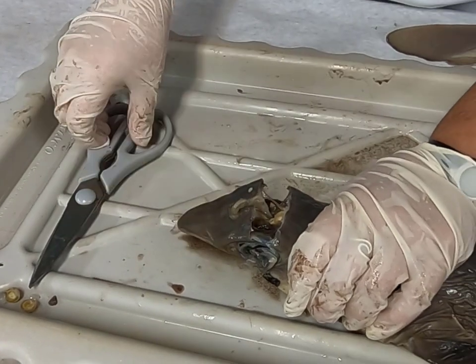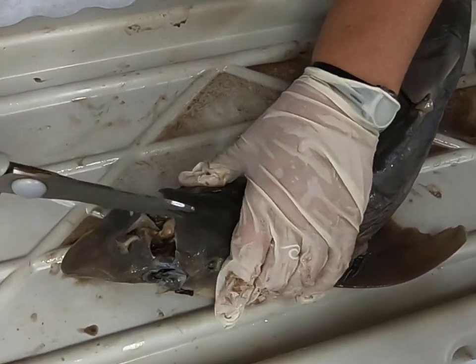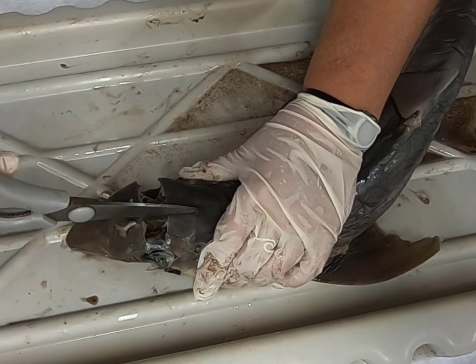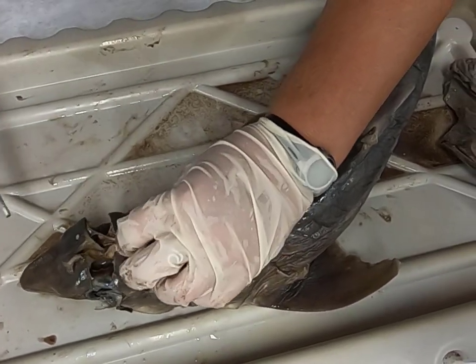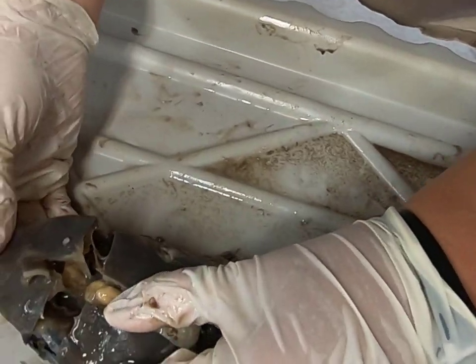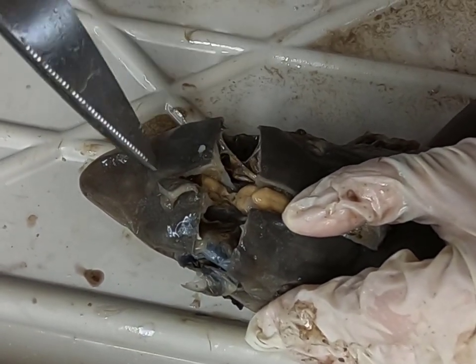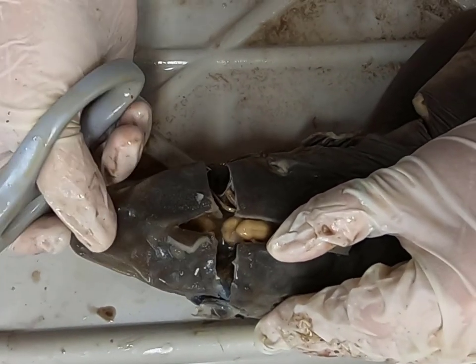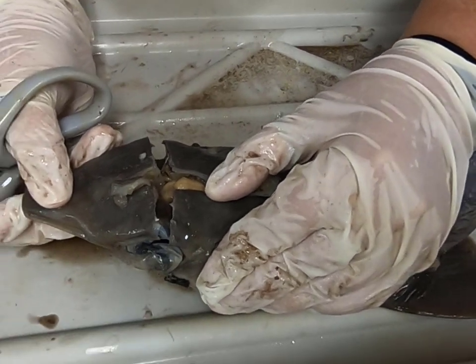A little bit more to that brain. And I'll cut a little bit farther back so you can see just how far it goes. And there it is. That is the shark's brain. There, there, and right there. So if you guessed about the size of an almond, you are correct.